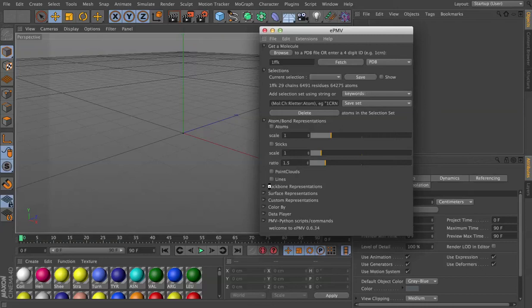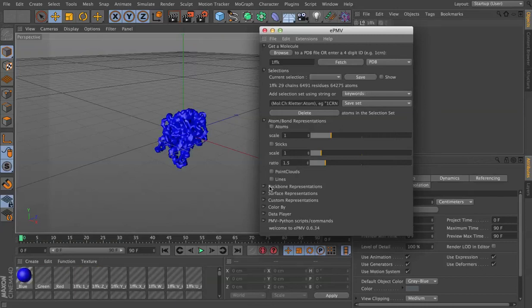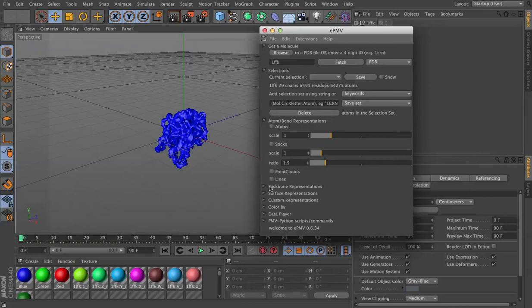because the coarse molecular surface we're going to generate is going to be relatively simplified, cutting corners through the atoms as it smooths itself out. We want to make sure that we capture the shape as accurately as possible.